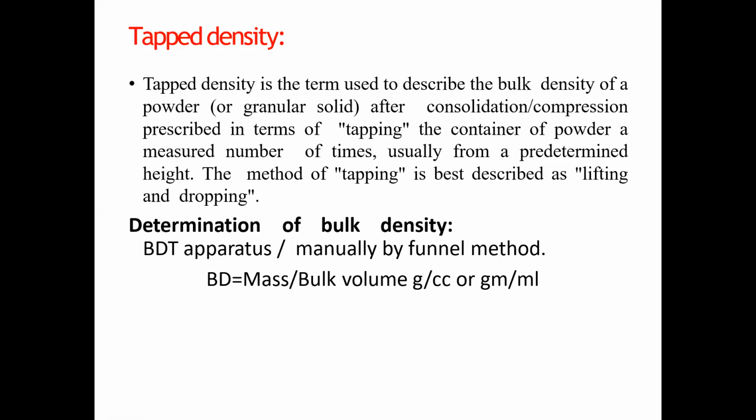Then what is tapped density? Tapped density is the term used to describe the bulk density of a powder after compression or consolidation, described in terms of tapping the container of powder a measured number of times, usually from a predetermined height. The method of tapping is best described as lifting and dropping. Determination of the bulk density can be done by apparatus or manually by the funnel method.